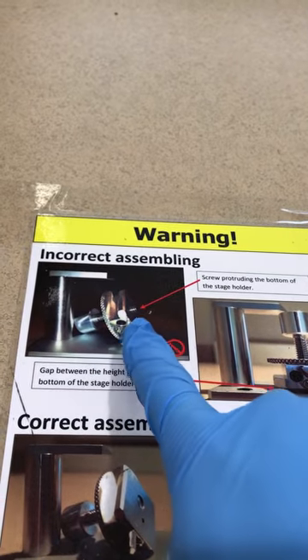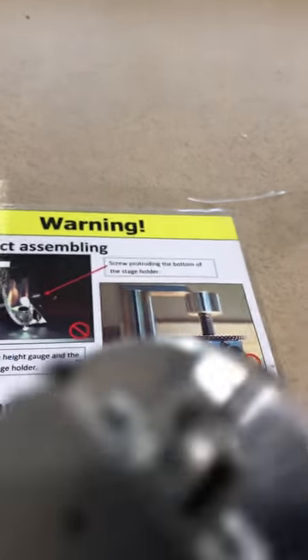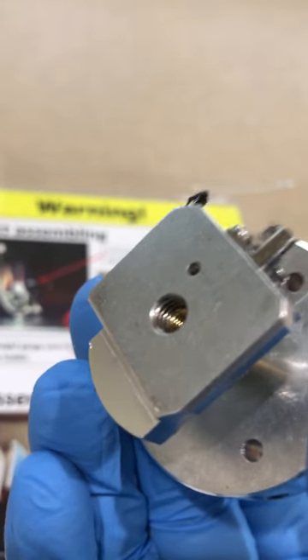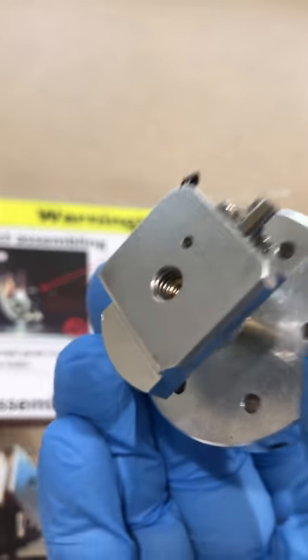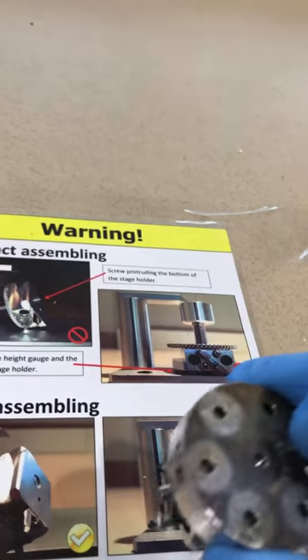Another thing to consider: make sure your screw is not coming out from the other side of your stage. If the screw comes out, it will get stuck inside the microscope and you won't be able to remove it. Always verify the screw is not protruding from the other side.